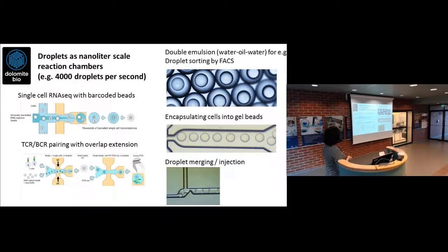So later on, we already ordered a droplet merging chip. I have it here as well. We have an idea, because here you can merge or actually inject more reagents into each droplet, so that we could do later steps like PCR also in those droplets. We are testing that soon.